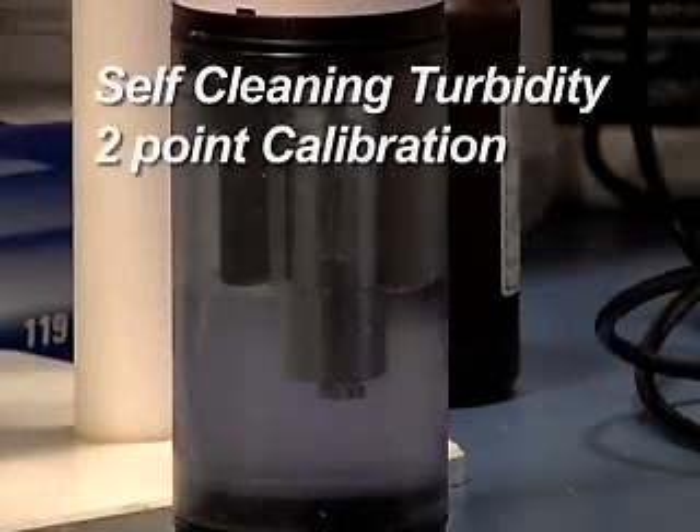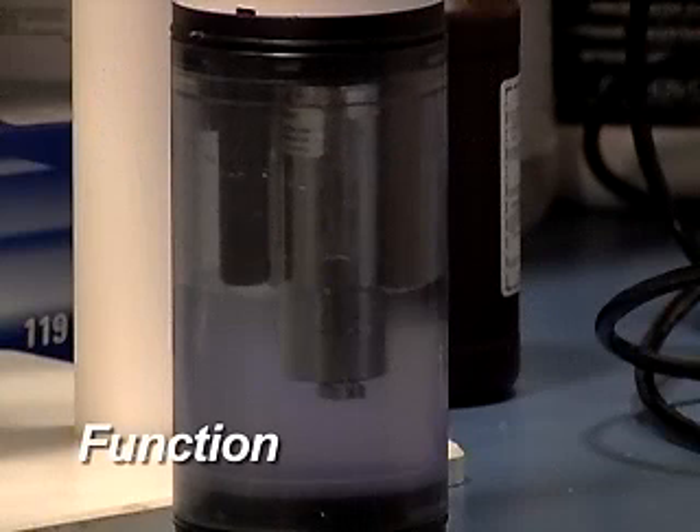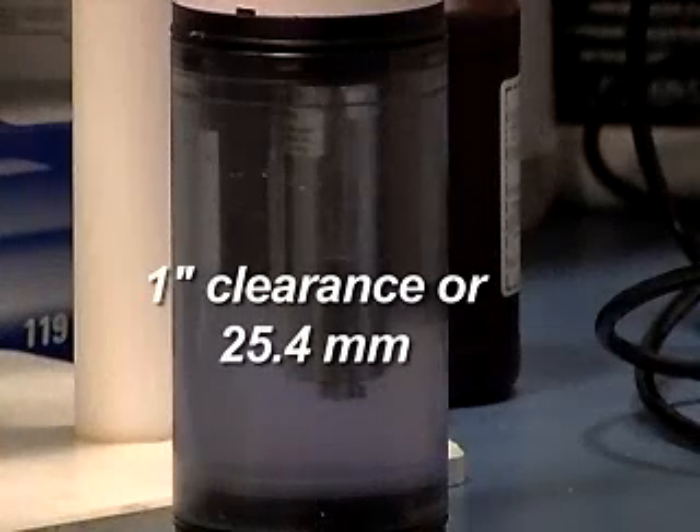Self-Cleaning Turbidity Two-Point Calibration. The Hydrolab Self-Cleaning Turbidity Sensor measures the intensity of light scattered by particles in the water sample at 90 degrees from an infrared light source and reports that value in NTUs. In order to take an accurate measurement of the scattered light, the sensor requires an unobstructed view of the water extending approximately 1 inch or 25.4 millimeters from the end of the sensor.